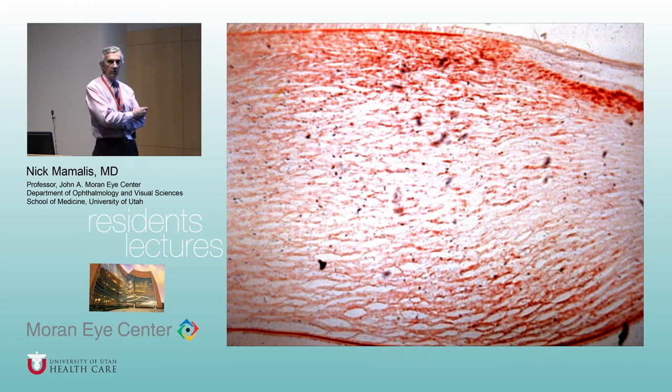Oil red O. So this is an easy one to remember because it stains those little O's red, and they've got oil in them. So oil red O. What do we have to do to the tissue in order to get this stain to work? Has to be fresh. Because if we process it through, the oil gets dissolved.